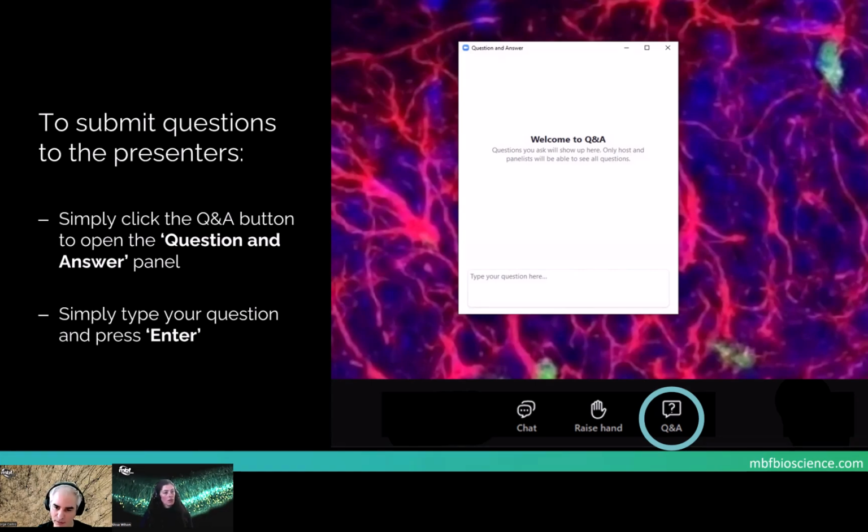And there's one additional question about quantifying expression levels using immunohistochemistry or RNAscope. The technique that we are showing here, the optical fractionator, is going to give you an estimation of number of cells. We are counting particles. We are not doing intensity analysis to quantify expression levels, if that's what you mean. So if particles could be a proxy for expression, then maybe.